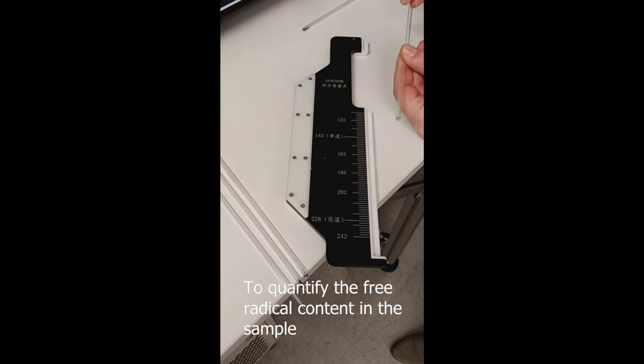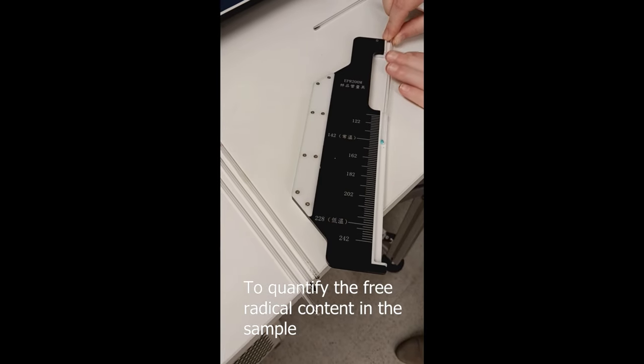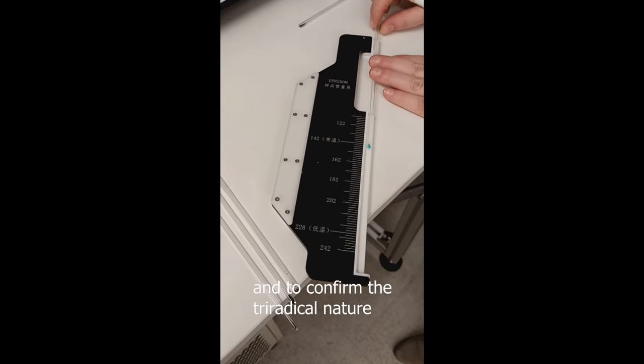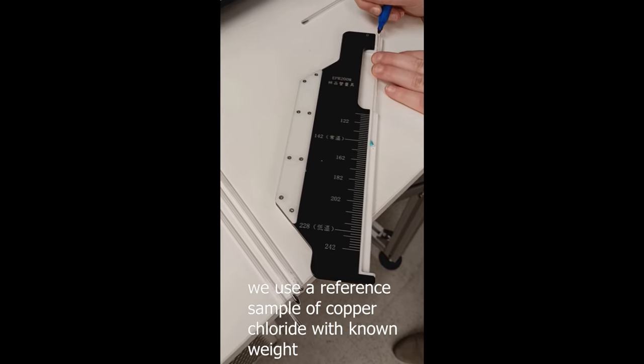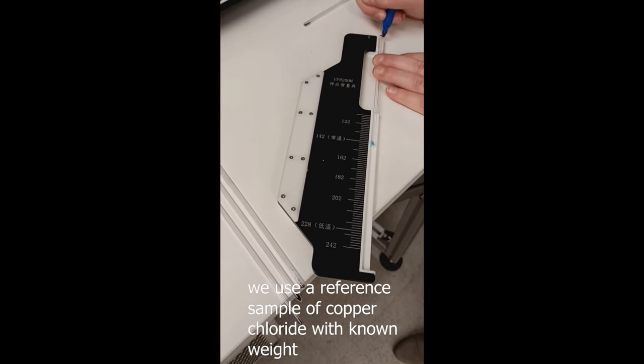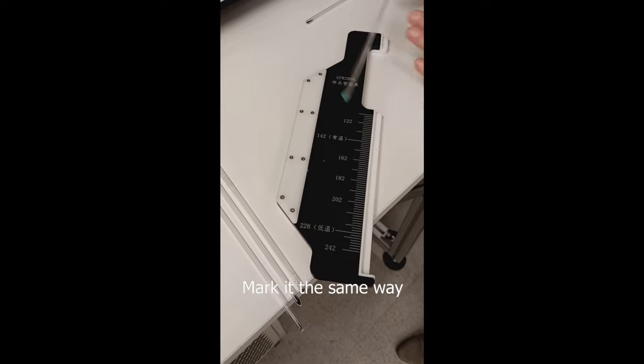To quantify the free radical content in the sample and to confirm the tri-radical nature, we use a reference sample of copper chloride with known weight. Mark it in the same way.